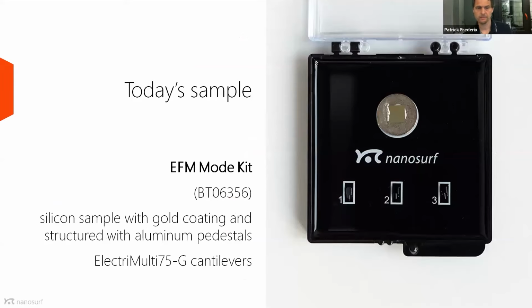As said, today's sample is the EFM mode kit that we have. And in the EFM mode kit, there is a sample. It's mounted on a metal disc. The top is made conductively connected to this disc with a two-component epoxy cement. And then this is placed on a conductive sample holder that is grounded to the scan head.